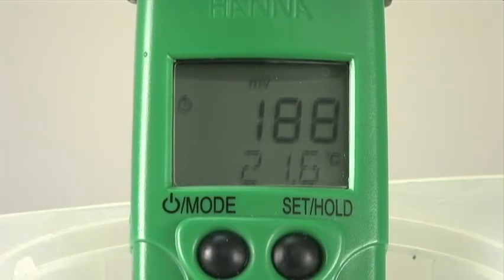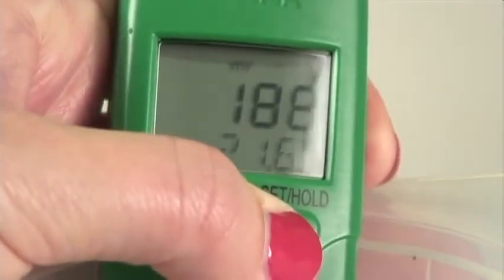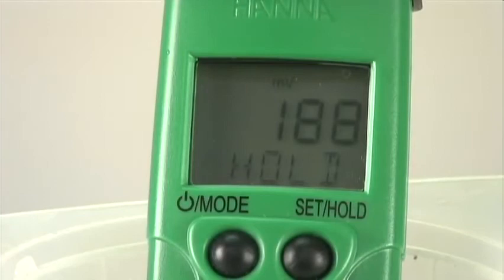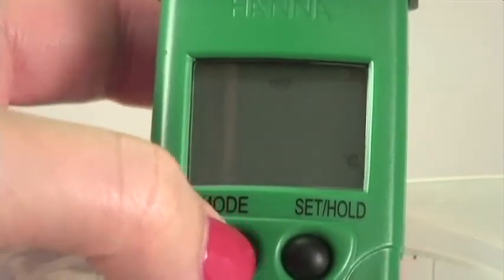You can freeze the millivolt reading by simply pressing the set hold button. To return to the normal mode, simply press any button.